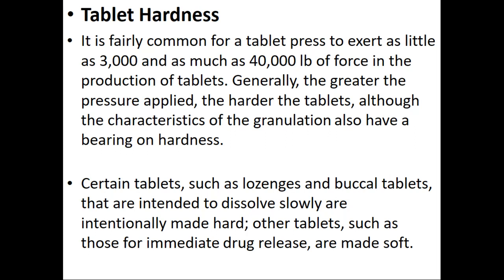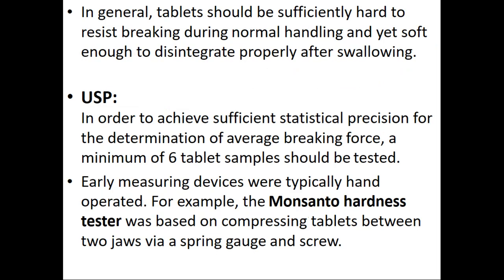While we have other tablets such as those for immediate drug release are made soft. In general, tablets should be sufficiently hard to resist breaking during normal handling and yet soft enough to disintegrate properly after swallowing.